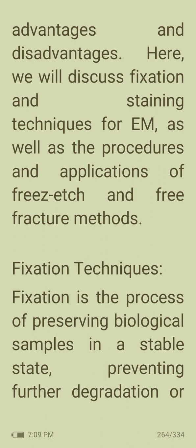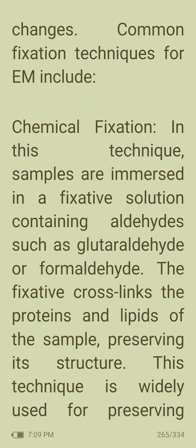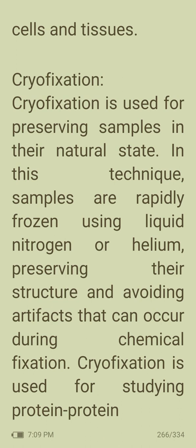Fixation techniques. Fixation is the process of preserving biological samples in a stable state, preventing further degradation or changes. Common fixation techniques for EM include chemical fixation. In this technique, samples are immersed in a fixative solution containing aldehydes such as glutaraldehyde or formaldehyde. The fixative cross-links the proteins and lipids of the sample, preserving its structure. This technique is widely used for preserving cells and tissues.